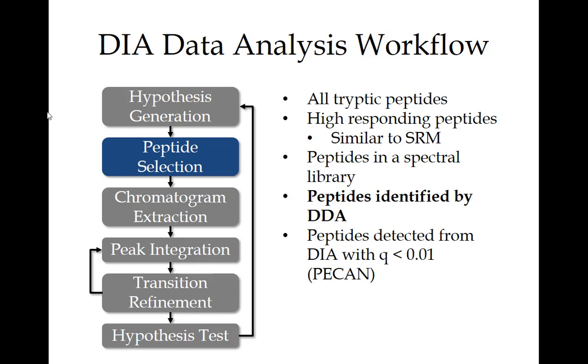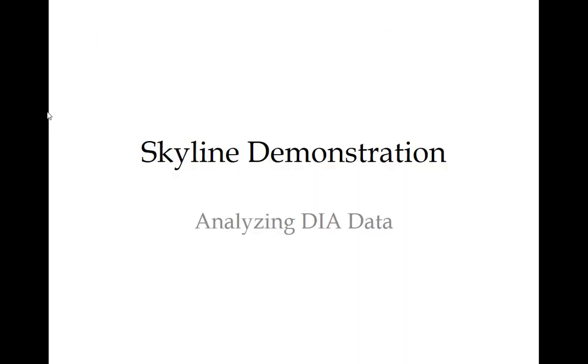So imagine that we have these samples and we just did, say, 3 DDA runs in the beginning and database searched them. That's what I'm going to take you through and how to do DIA-based quant for those. Later on, we're going to have a presentation where you would have generated a library where you do, say, chemical fractionation and then DDA to get a deeper library and analyze those in DIA. And later on, even further in the course, Brian will talk about generating a chromatogram library. But for now, just imagine we've done some DDA runs and we're going to query the data.